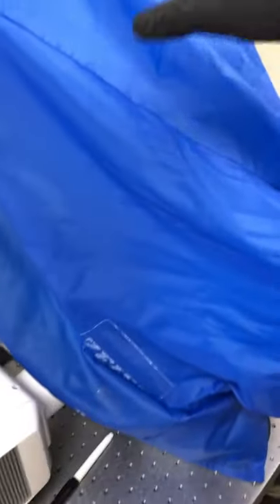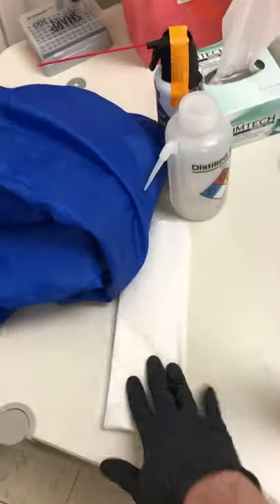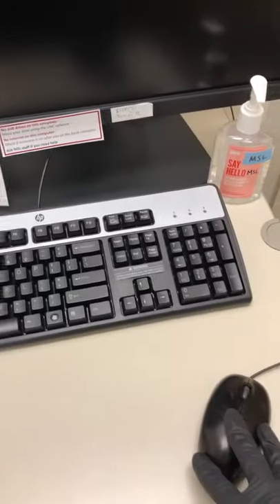Let me show you how to do that. First we can remove the dust cover. You'll see here on this table — sometimes it's over there — we have 100% ethanol, which we'll use in combination with lens paper to clean the eyepieces. We will use the 70% ethanol in combination with Kim wipes to clean the knobs, the joystick, the touch screen, the keyboard, and the mouse.